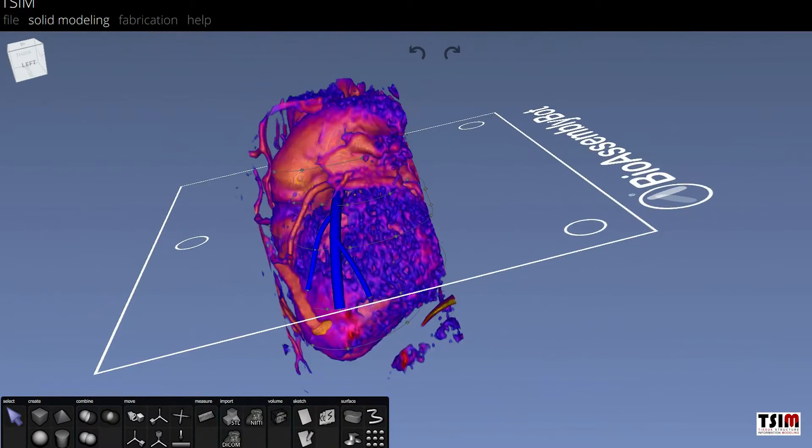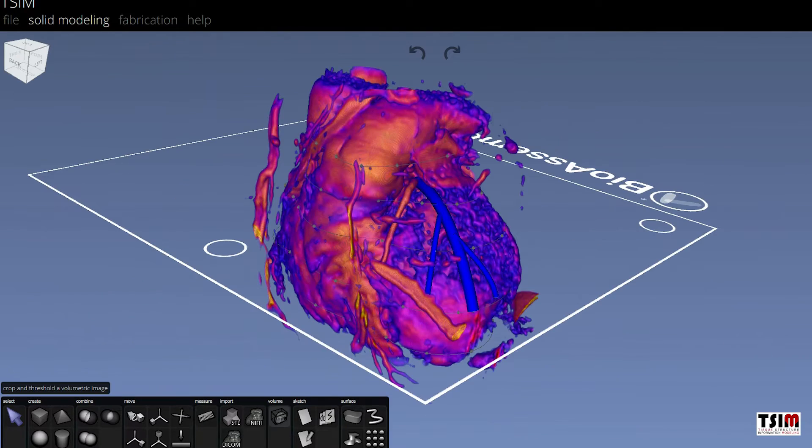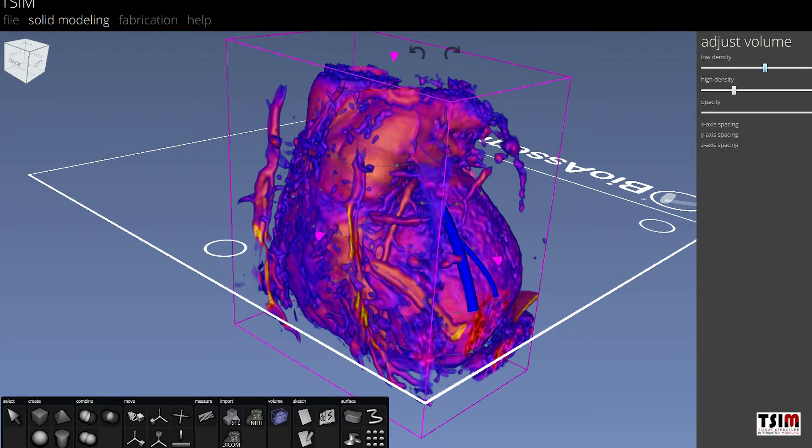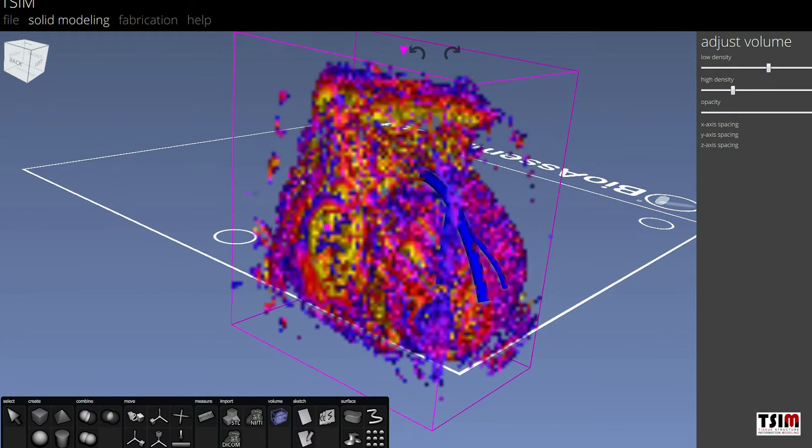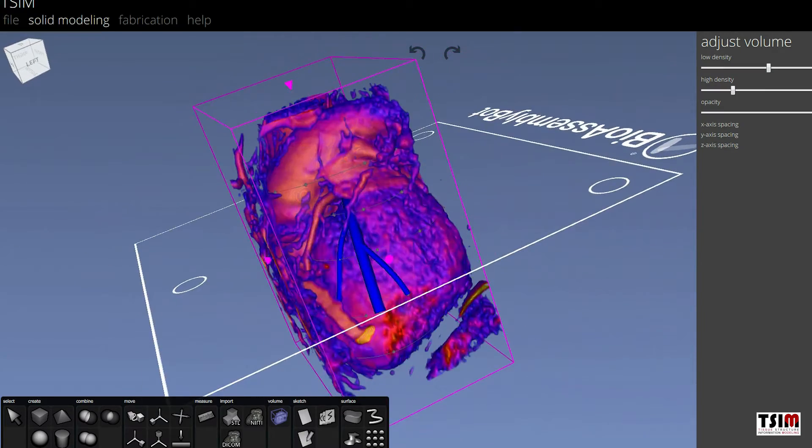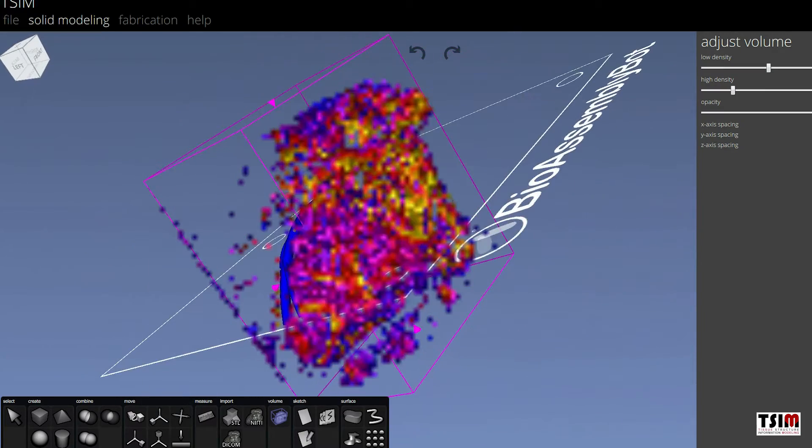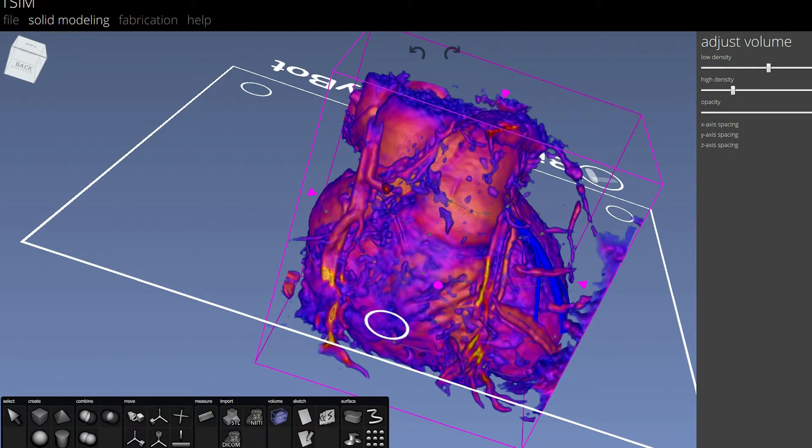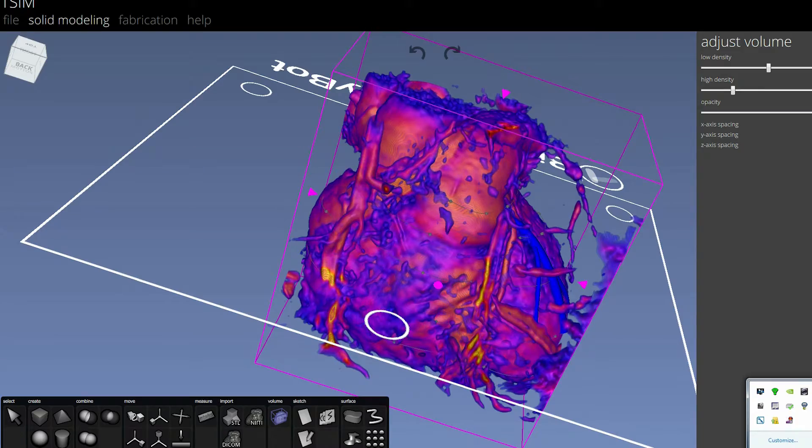Here those new vessels are being placed on the heart. They're drawn in blue in this case, but they can be of any color. You can appreciate also the additional structure that's present within the patient's heart that can be captured.